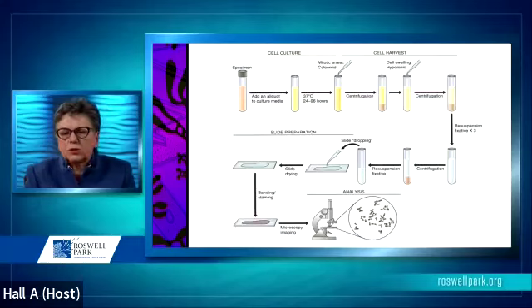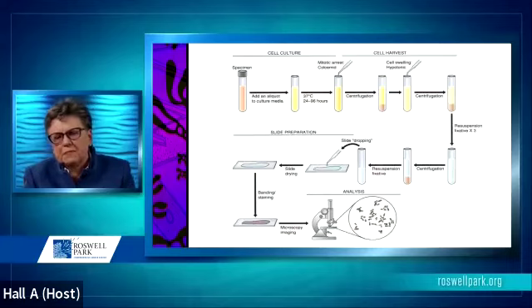These take at least 1 to 2 days to be completed in order to do a complete chromosome analysis. The cell culture takes place usually overnight, but can extend up to maybe 96 or more hours, depending on the cell location that we're looking at.